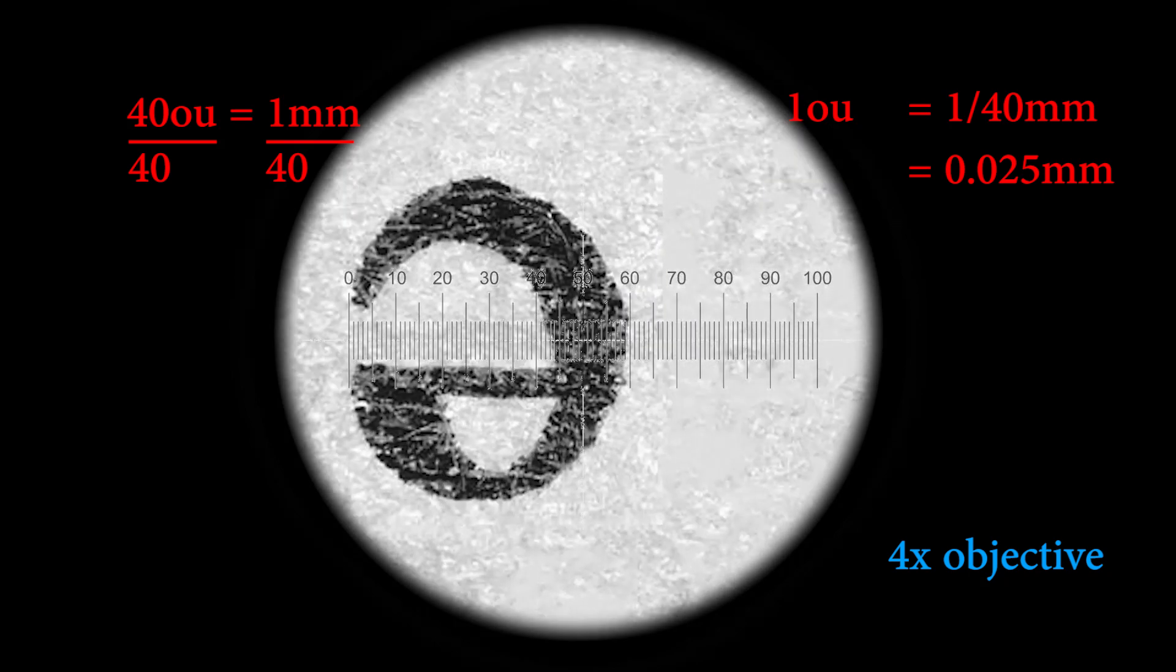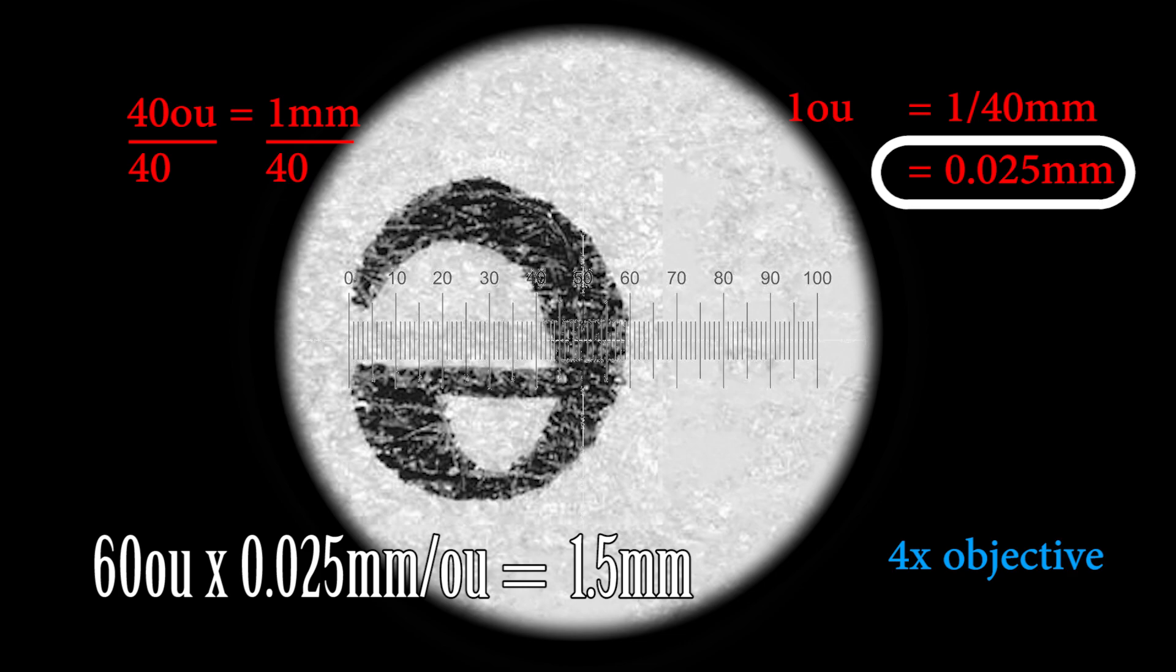We can then count ocular units, in this case 60, and then convert to a millimeter measurement. This letter E is 1.5mm wide because 60 ocular units times 0.025mm per ocular unit is 1.5mm.